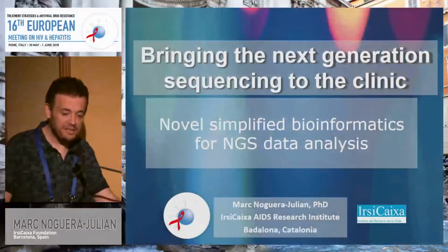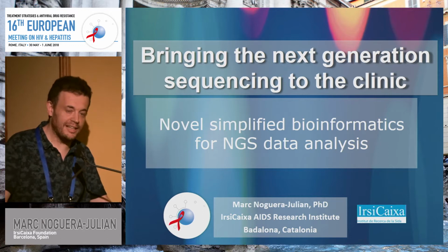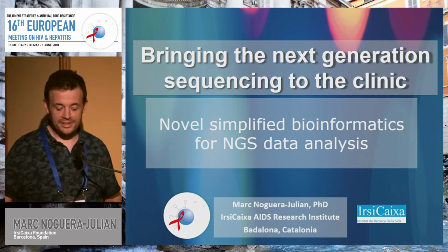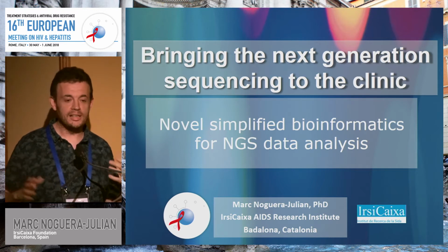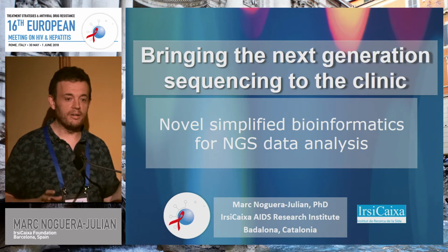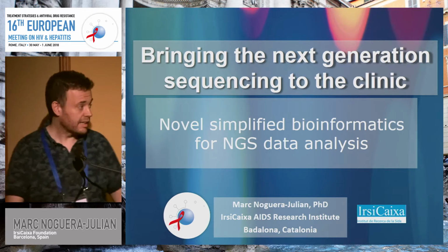From the bioinformatician's point of view, we like to be valued, but we keep working hard to be costless. So we try to program everything just to lower the cost more and more. So what I will try to do today is to bring you an overview of the simplified tools that from bioinformatics we have programmed to simplify all the data analysis for NGS resistance testing.